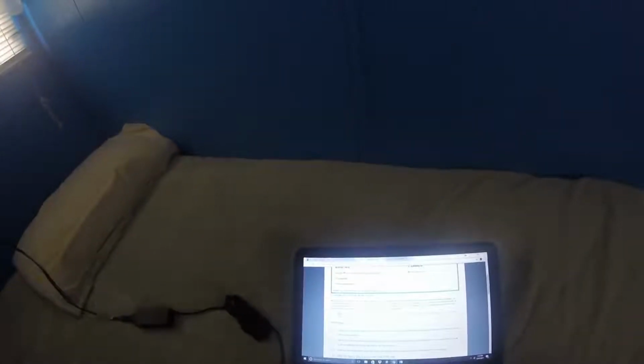So for this one, we have to log into the eScience Lab student portal, locate the virtual microscope activity, and the evidence in crime scene section. Take a tour of the virtual microscope by clicking the Start button on the top right hand side of the screen and learn how to use it. So once I've become comfortable using the virtual microscope, switch views so that I'm looking at the microscope.